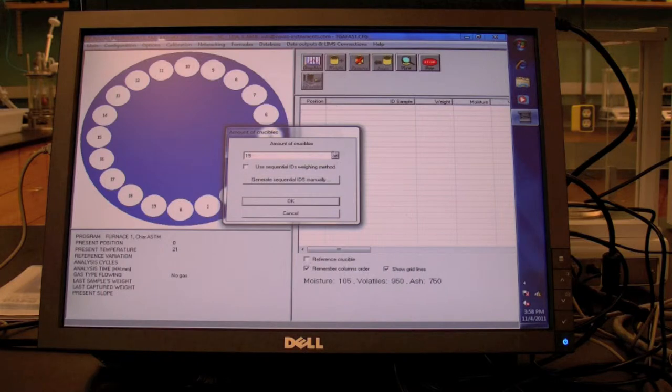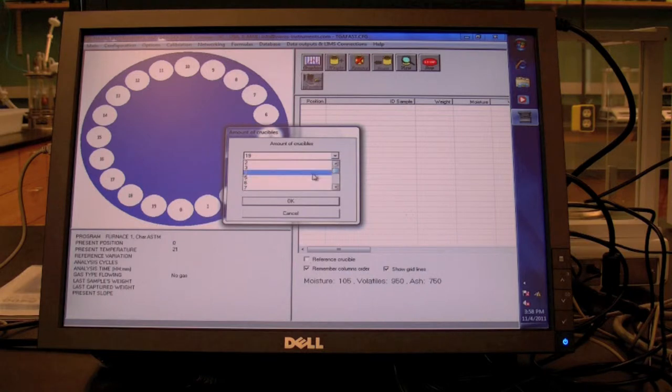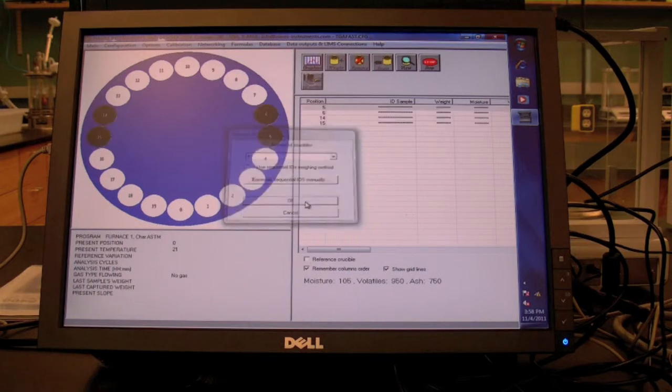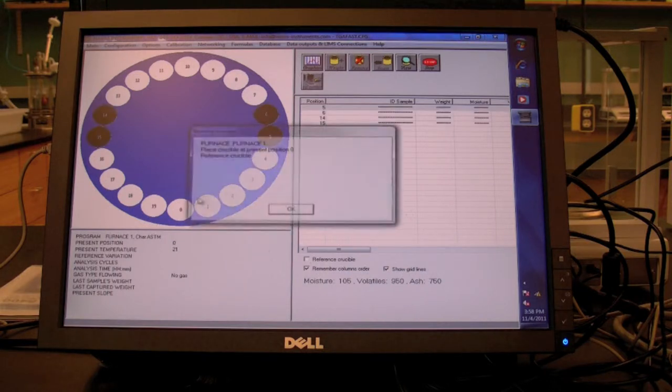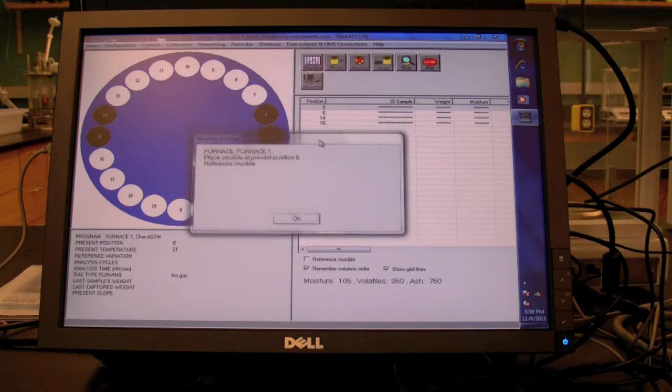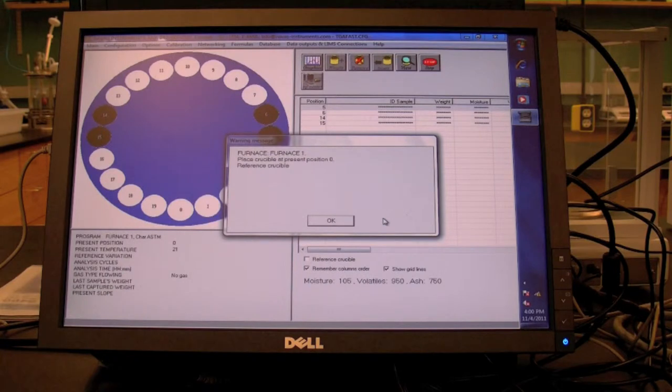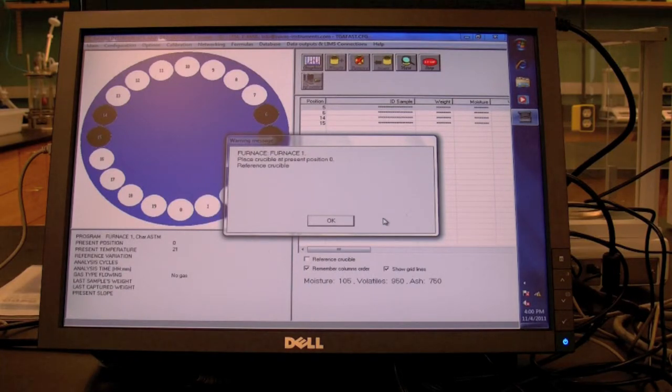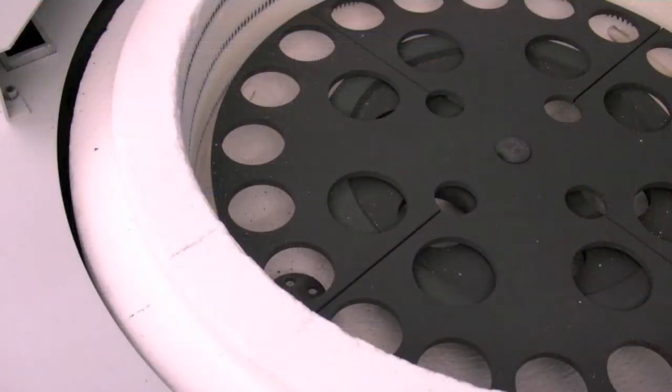When prompted, enter the number of samples to be tested, not including the empty reference crucible. Carousel positions will appear to fill in carousel diagram indicating which slots to be used in the analysis. A message will appear asking you to place a crucible as a reference on position zero, the home position.